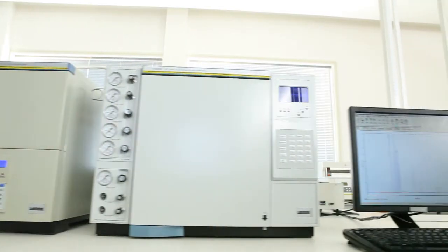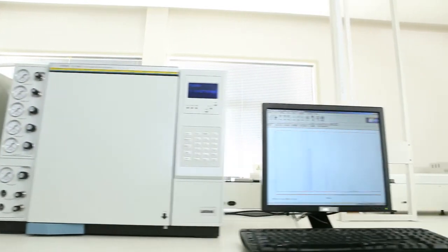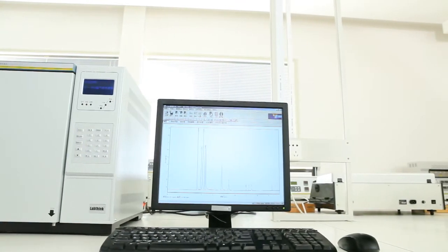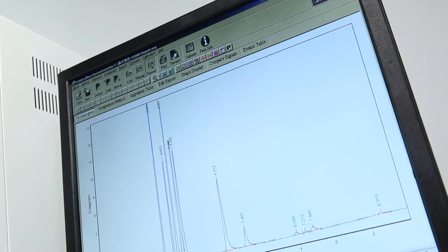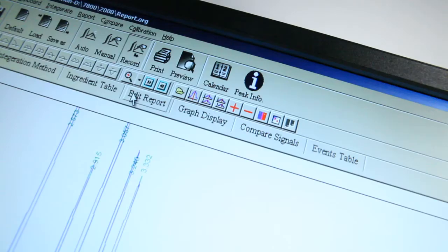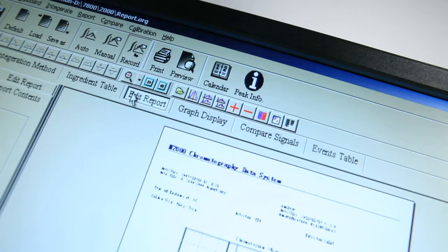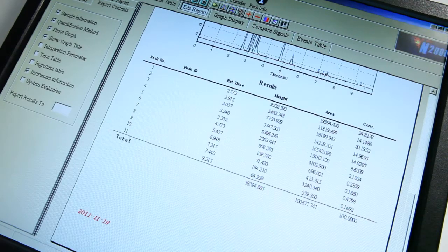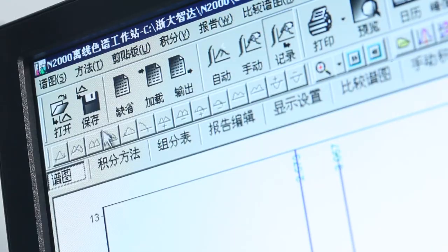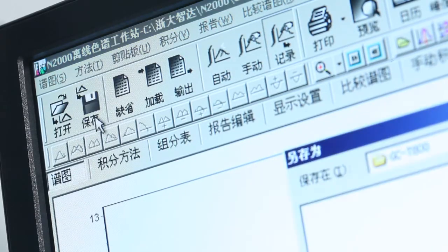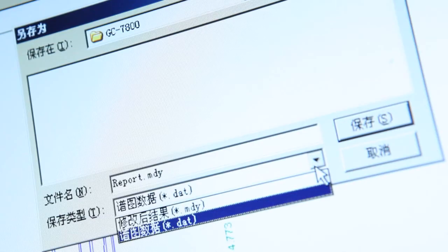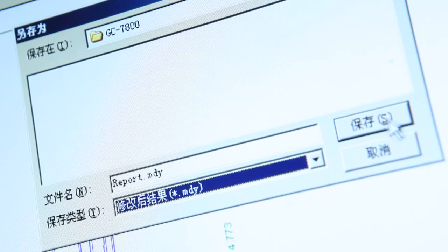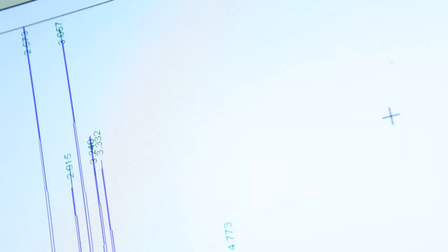The professional gas chromatography software equipped with this instrument provides powerful data reanalysis and reprocessing function. Also, the multi-format report exporting function makes the sharing of test data easier and more convenient.